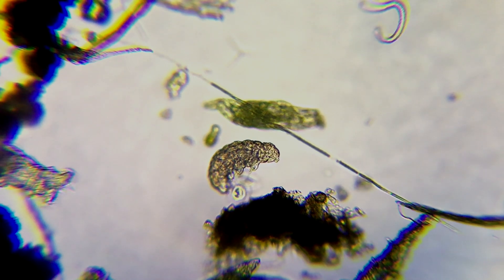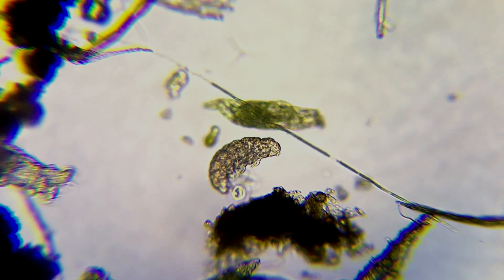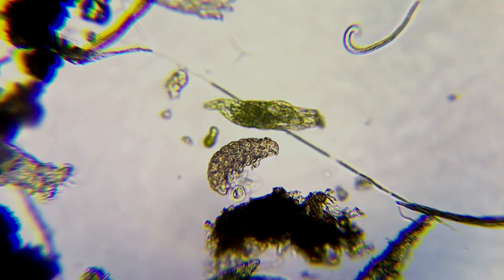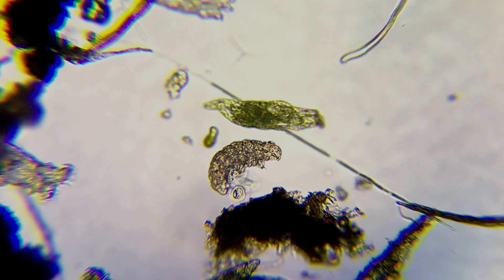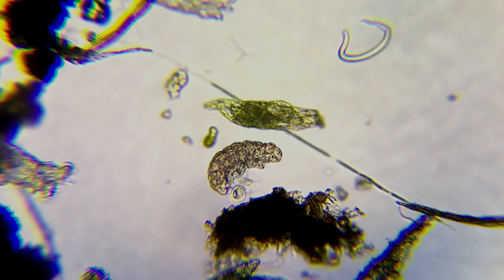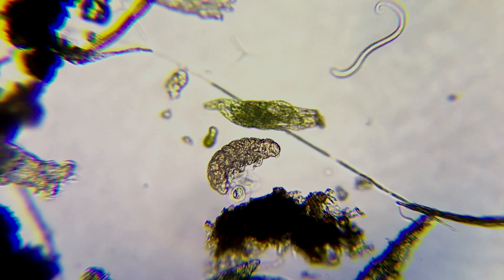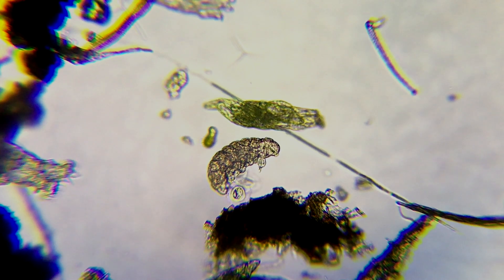There's a rotifer over there, and we forgot to mention — when you filter, there's not as much small stuff for the rotifer to eat, so it will just be filtering and not actually get any food, just filtering for a very long period of time. Another type of thing that we found a lot of was nematodes, which are on the other side.